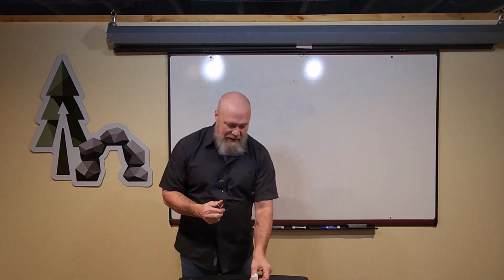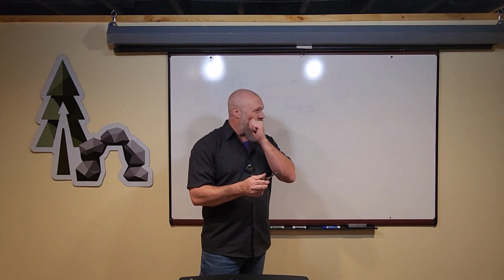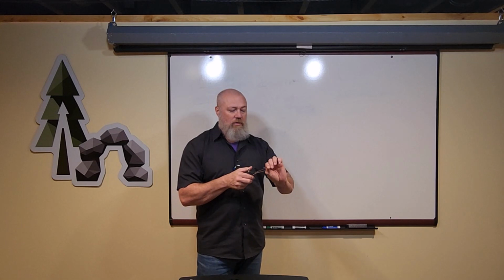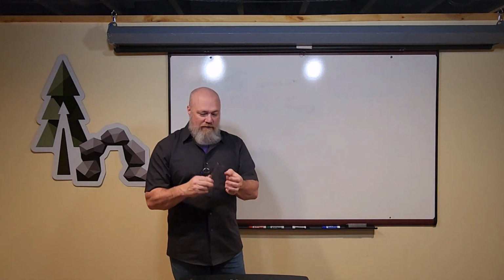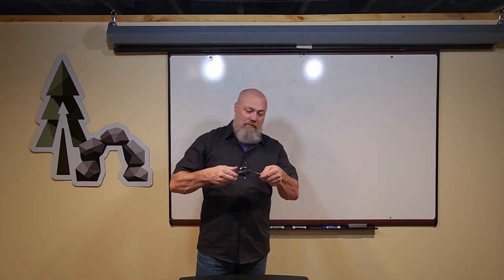Right. I'm going to take the blade out. If you've never handled a scalpel blade before, they are ridiculously sharp. The type of sharp cuts you and you won't know you've been cut. So I will not try to put this onto the scalpel handle with my fingers. I will use my forceps or my hemostat, mostly hemostat, and then I will hold the blade, keeping my fingers well away from the edge, and then slide that handle down in there until it clicks.